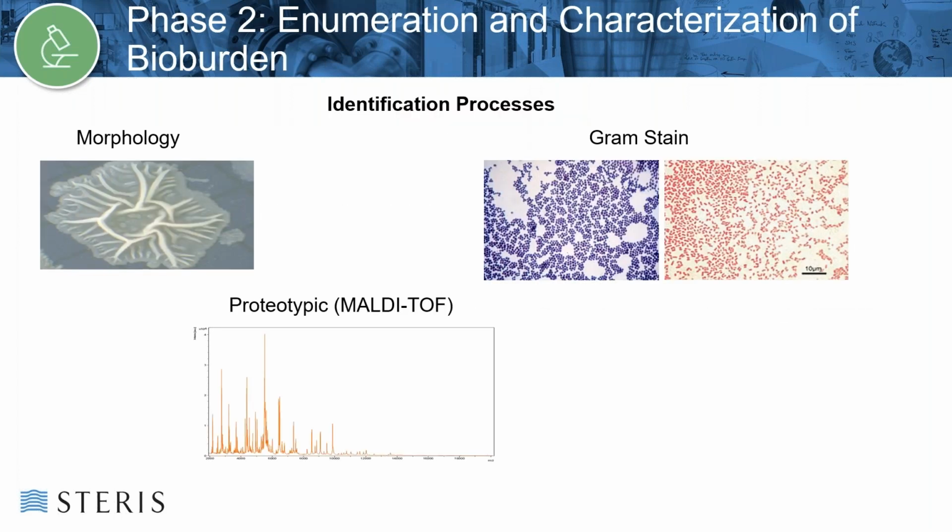Most basic forms of identification are selective culturing, colony morphology, and gram staining. Selective culture uses selective media, heat shocking of extract, or incubation conditions to detect certain types of microorganisms. Colony morphology gives a visual description of the colony's growth characteristics, such as color, shape, consistency, etc. For example, the organism in the top left picture is cream, wrinkled, dry, with an irregular edge. The visual description helps to classify observed phenotypes over time.